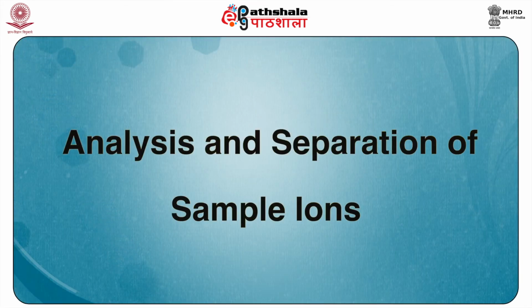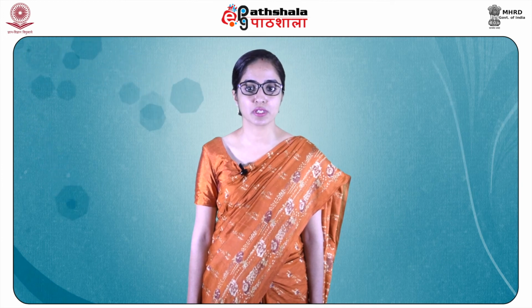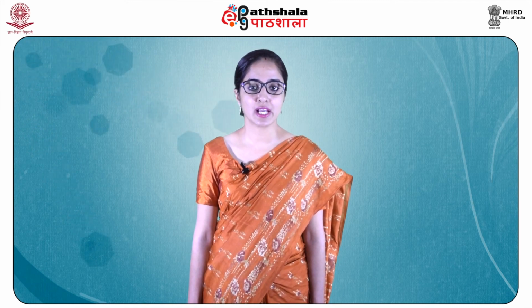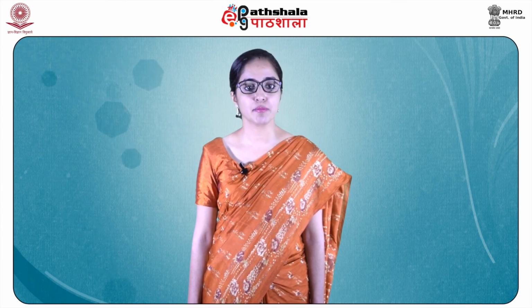Now, let us come to the study of analysis and separation of sample ions through the mass spectrometer. The function of utmost importance in a mass analyzer, students, is to separate or resolve the ions formed in the source of ionization of the mass instrument according to their own mass to charge ratios. There are a number of mass analyzers currently available, as I have already discussed above, the better known of which include the quadrupole, magnetic sectors, electric sectors and time of flight analyzers, and both Fourier transform and the quadrupole ion traps.